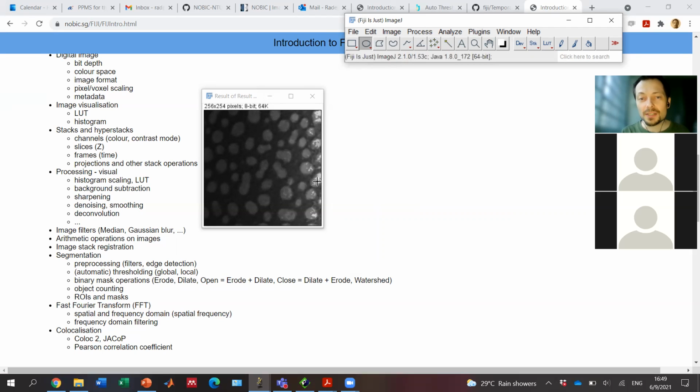So here it happened that at one stage I got some saturation. This will obviously affect the segmentation, so just don't look too much at this very edge. It's not a perfect example that I prepared.